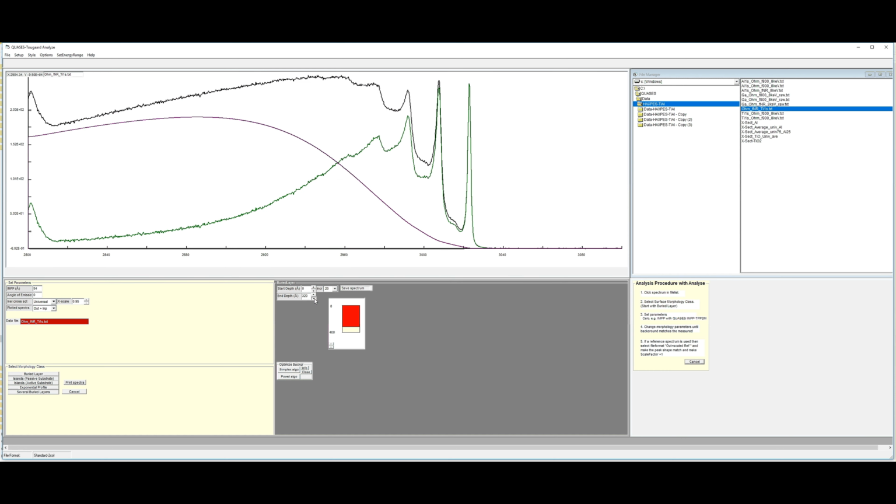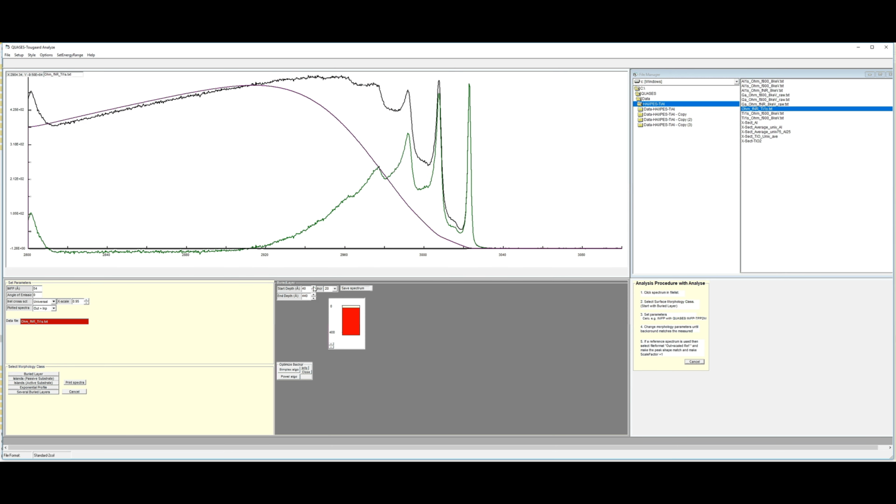Now, if we use a universal cross section, we increase the thickness here and increase here, decrease here, and one more down here. We have a reasonable account for the background over the full range here, but not in this range.